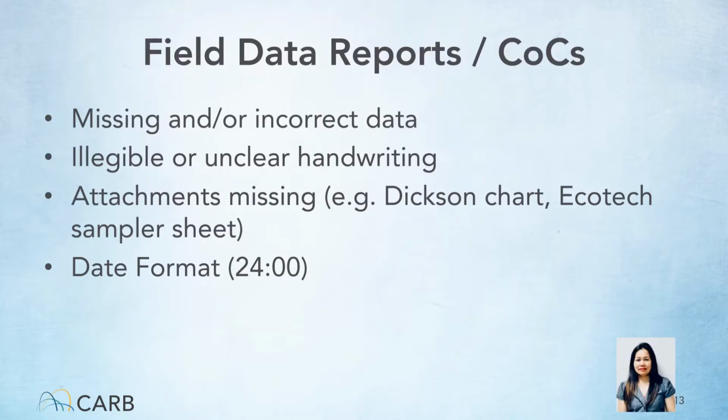Hello, I'm Minda Dimano. We would like to go over some of the most common issues we encounter on the chain of custody forms or field data reports submitted to the lab. The first one is missing and/or incorrect data. I will elaborate on this in my next slide. The second is illegible or unclear handwriting. It is always our goal to make sure that all information in our database is as accurate as possible.